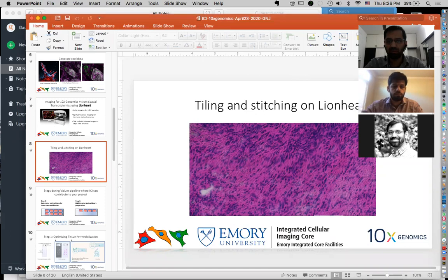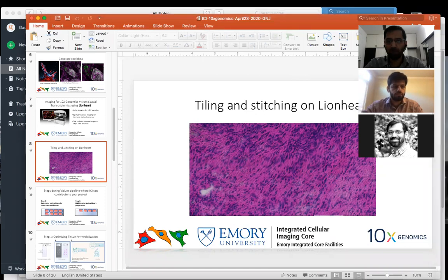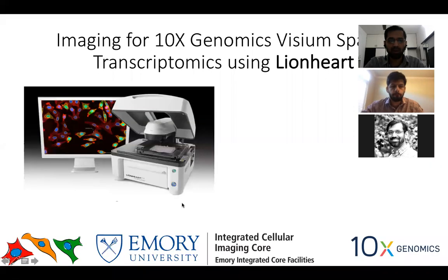Okay, can you see my screen? Yep. Okay. So the instrument that you will be using is Lionheart. We also have one more instrument, but that's not really set up right now. It's going to be easier to use that in future versus Lionheart. So just kind of letting you know about that.